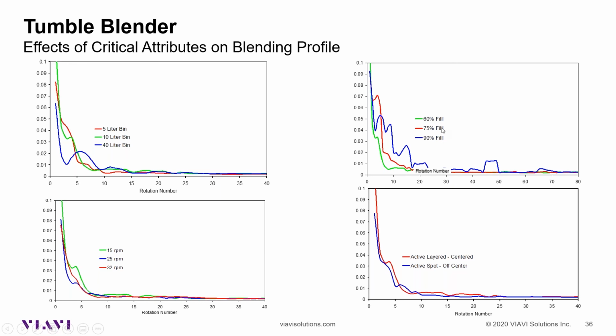Furthermore, you can play with the filling level, and depending on the filling level, you could have different profiles. Okay, you can have 60%, 75%, 90% of filling level. You can play with the rotation speed.